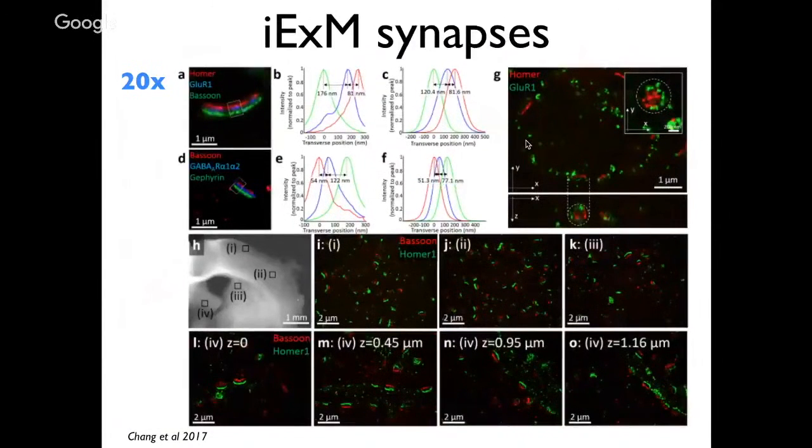And so here also you can do this with synapses, showing now optical imaging of several different molecular tags on the synapses, starting to get at the idea that when you're looking at the connectome, it would be great to also characterize something about the molecular makeup of each synapse. So here on the upper left, they're showing three different antibody tags against different components of the synapse.